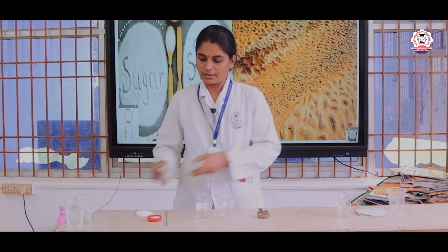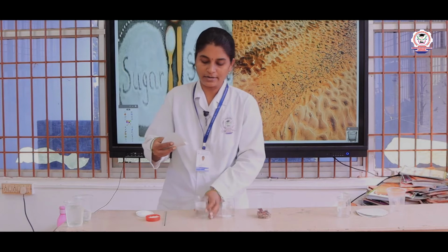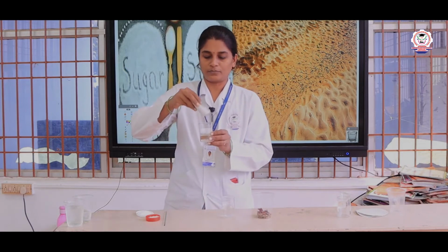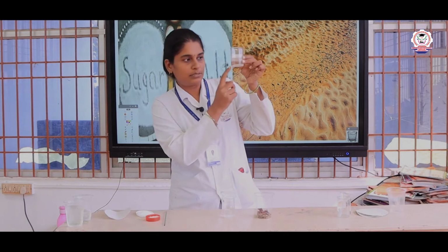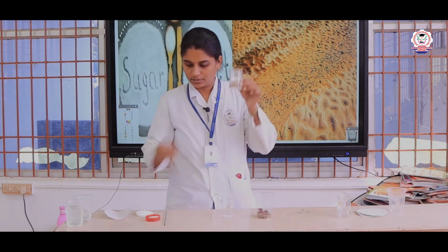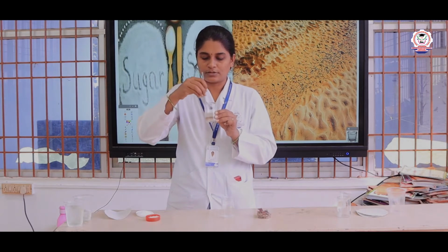Now I am taking a little bit of sugar and adding it into the water. You can see the sugar particles inside the water. Now I am stirring this.